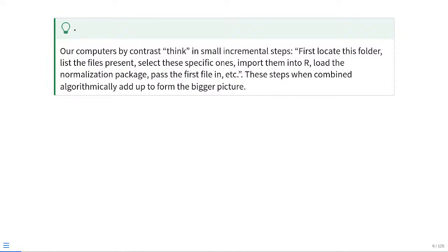And as immunologists, as flow cytometrists, we're not immune to being able to think in small pictures. So for example, let's think of we are doing an experiment. We don't just think of it in terms of we thaw some cells, we stain some cells, we go upstairs and acquire them on the flow cytometer. If we just break down the individual steps, after we thaw the cells, we need to spin them down in a centrifuge that has a certain speed and a certain amount of time. Afterwards, we dump, blot, and vortex the cells. Then if we go do a live stain, we add a live dead, etc., etc. So just like we think of our own experiments in small incremental steps, we just need to learn how to apply this small incremental step thinking when it comes to working with our computers and coding in R for the very first time.